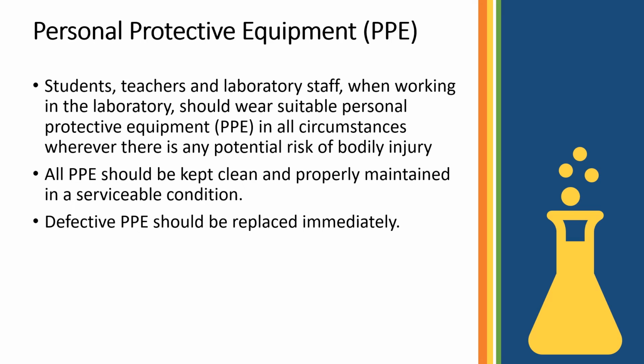Students, teachers, and laboratory staff when working in the laboratory should wear suitable personal protective equipment (PPE) in all circumstances whenever there is any potential risk for bodily injury. All PPE should be kept clean and properly maintained in a serviceable condition. Defective PPE should be replaced immediately.